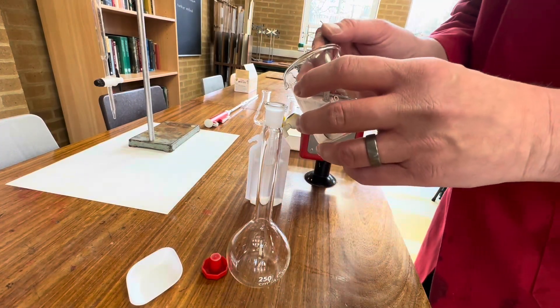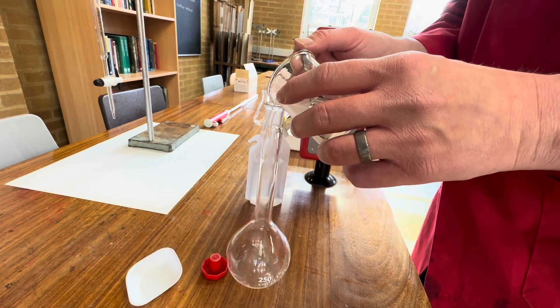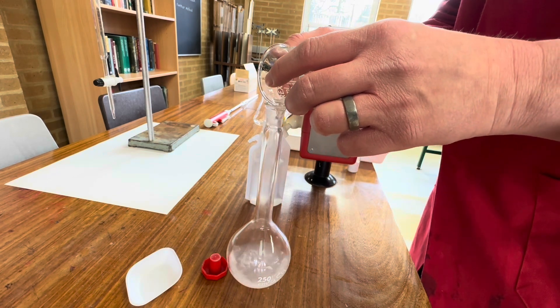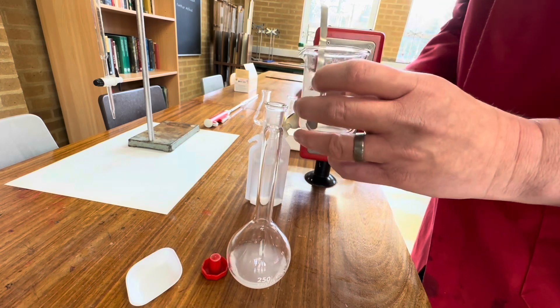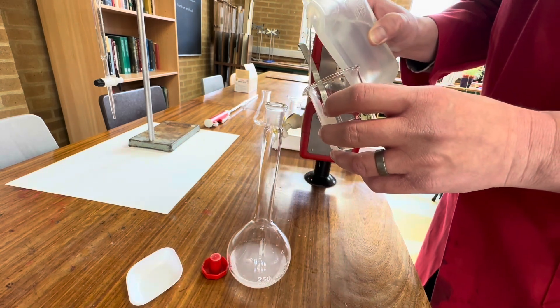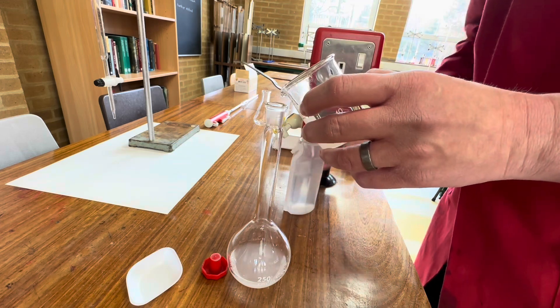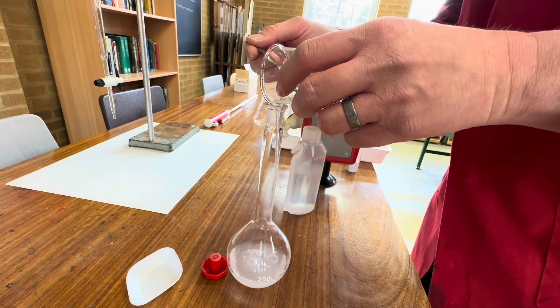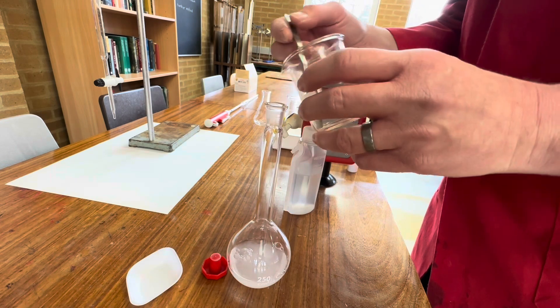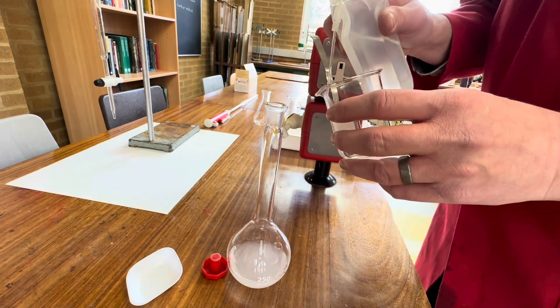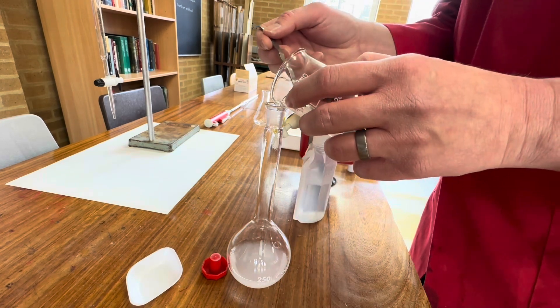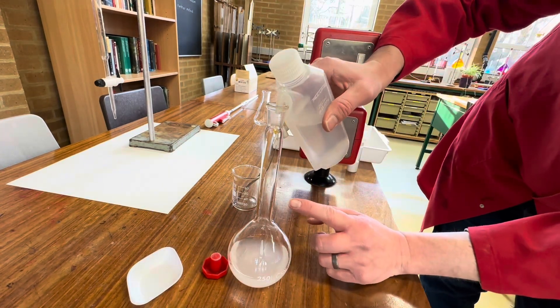Now we're going to carefully add it to our volumetric flask. And we're going to rinse it in. So we're just going to add a little bit more water, because we want to make sure that any undissolved carbonate has gone in too. And we're going to measure it up to 250.